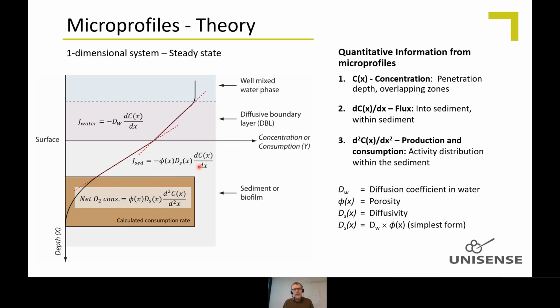The diffusivity here is in its simplest form calculated as diffusion coefficient times porosity. But you can do it in different ways, and I'll get into this tomorrow in this demonstration. There are different ways you can do it, and you can choose different methods in the software.